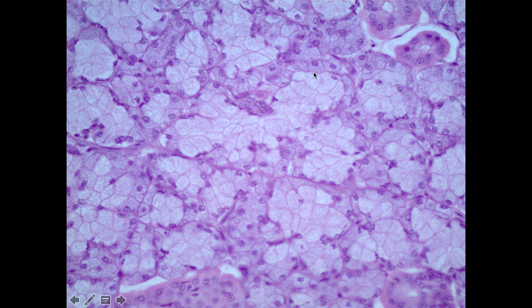and the cells that we see here, most of the cells that we see here are in fact the cells that secrete the contents. Maybe it's mucus, maybe it's saliva, maybe it's sweat, whatever it may be. These are the secretory cells. They have to secrete their contents eventually to the surface of the body or to the surface of maybe an organ. And so there are ducts. There are more familiar looking ET layers spread throughout. And this one only has a few up in the top right, maybe down here.